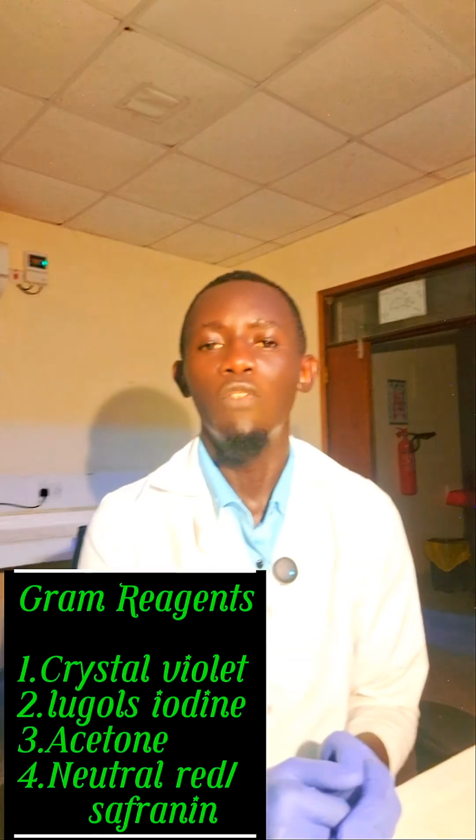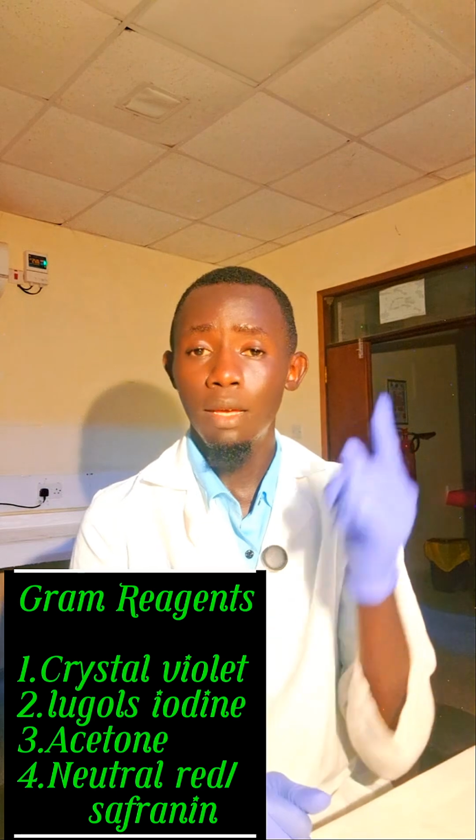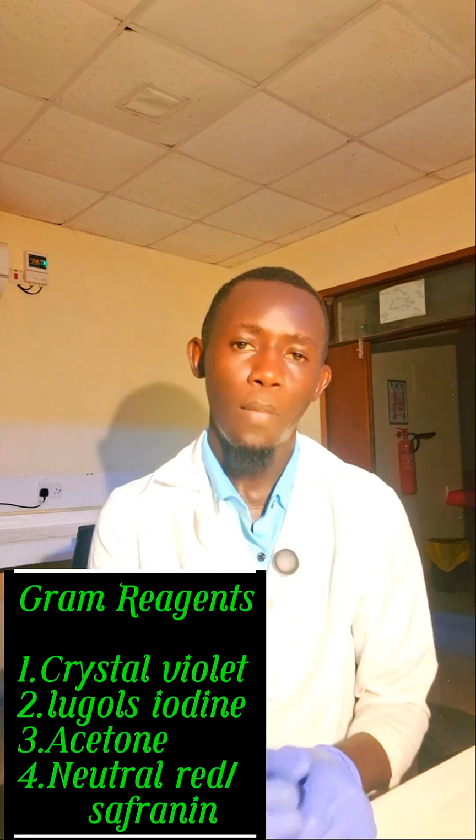And guess, we have four of these reagents. I'm talking about 1, crystal violet, 2, Lugol's iodine, 3, decolorizer, and the other one, which is a secondary stain, which is a counter stain or a secondary stain, that is safranin. We have a basic way to understand this, and I usually use the formula, that is, it is CIAN, C-I-A-N. C for crystal violet, I for iodine, which is Lugol's iodine, A for acetone, which is a decolorizer, and N for neutral red, that is the counter stain.